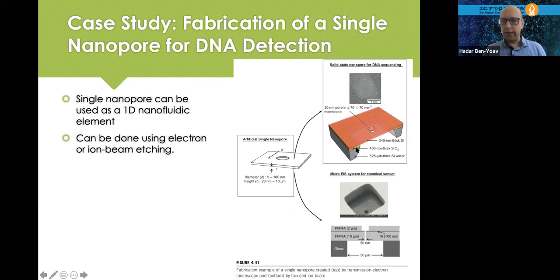You have 2 electrodes here and here, and you measure changes in the electromagnetic field. So you measure changes with the signal. Here it looks much better. You have 2 electrodes, nickel, and the DNA just flows through from one side to another. The idea is that whenever the DNA flows, you get a signal, so you can detect how many DNA copies you have, for example.